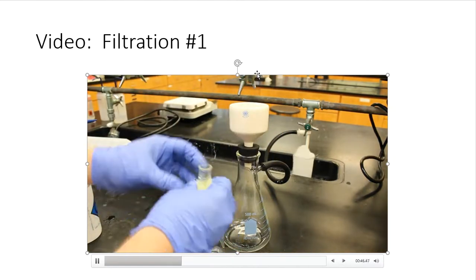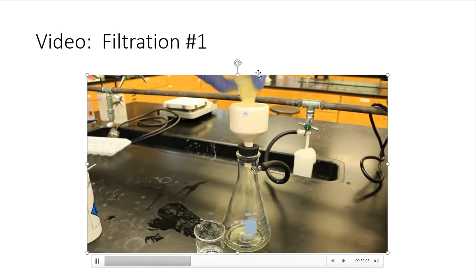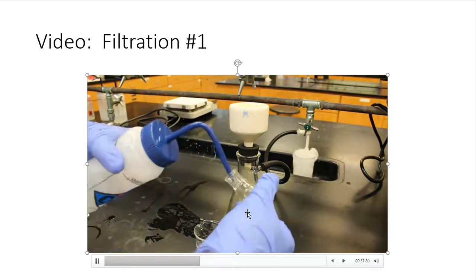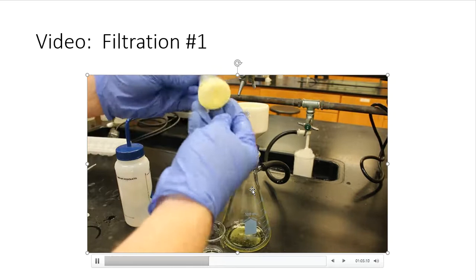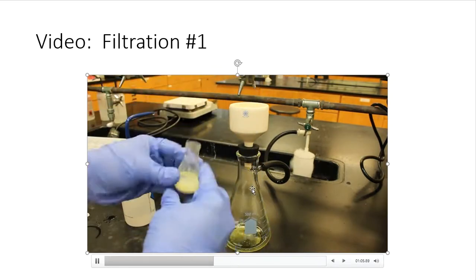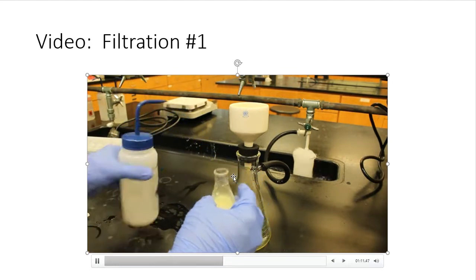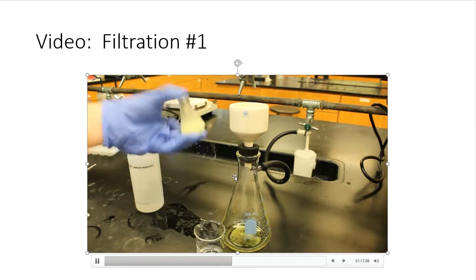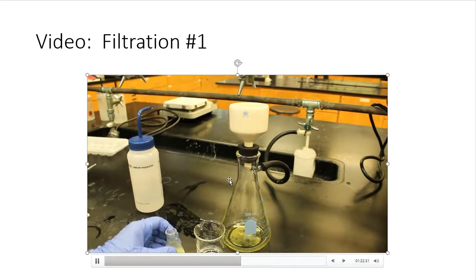Acetanilide is going to be the first. And there it goes, folks. There it goes. Down the hatch. Notice the crystals that are left behind. Again, I want all of those transferred out, so I'm going to keep transferring it over and over as much as I can. I want to recover all of those crystals for reporting procedures. Not reporting. What's reporting procedures? Who knows?